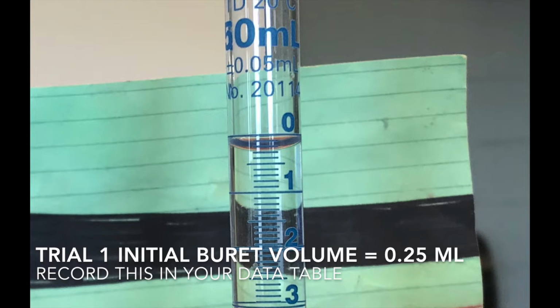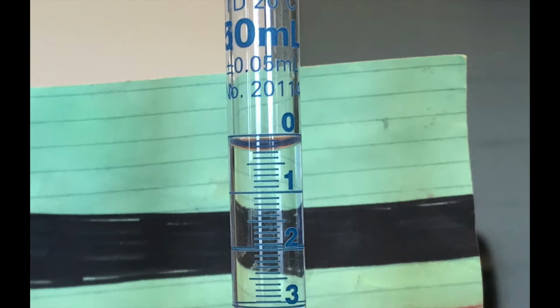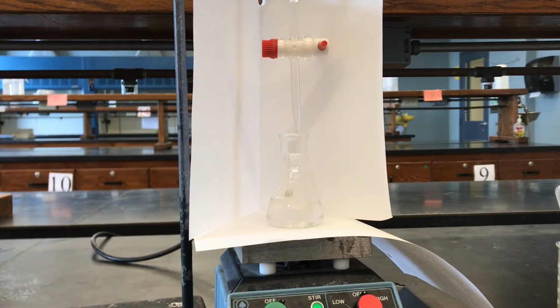And just remember that when I say 0.25, the 5 is where our uncertainty is. We know for sure that the meniscus is lying between the 0.2 and the 0.3 line, but you have to just make your best guess at what the last decimal place is. So it really could be 0.24, it could be 0.27, but you just have to make some kind of judgment, and then you just recognize that you're uncertain about the last decimal place. So my estimate here is 0.25 milliliters.